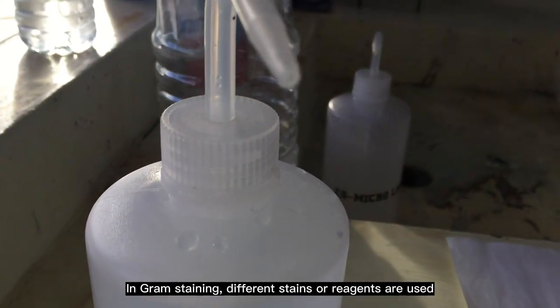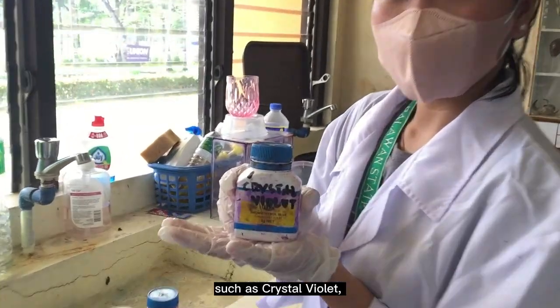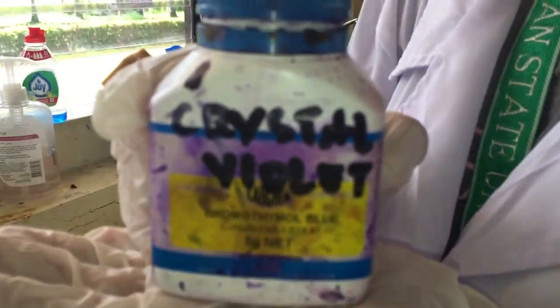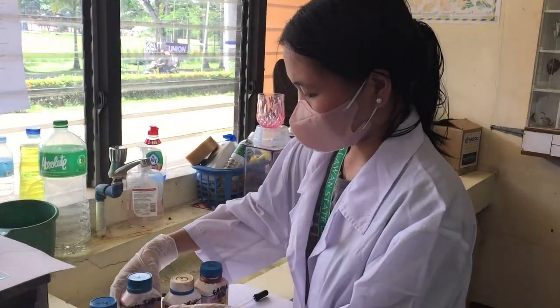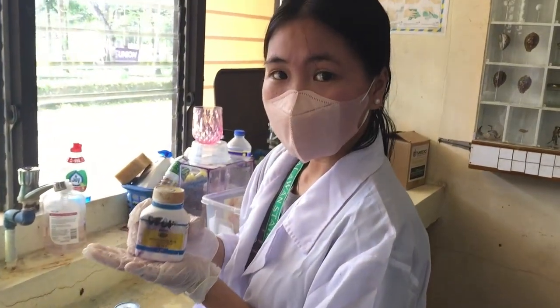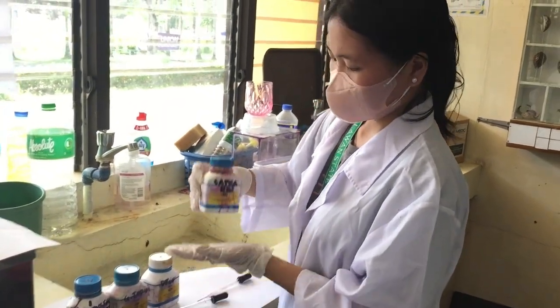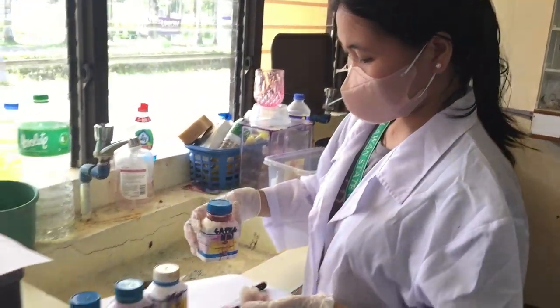In Gram staining, different stains or reagents are used, such as crystal violet, Gram's iodine, decolorizer, and safranin.